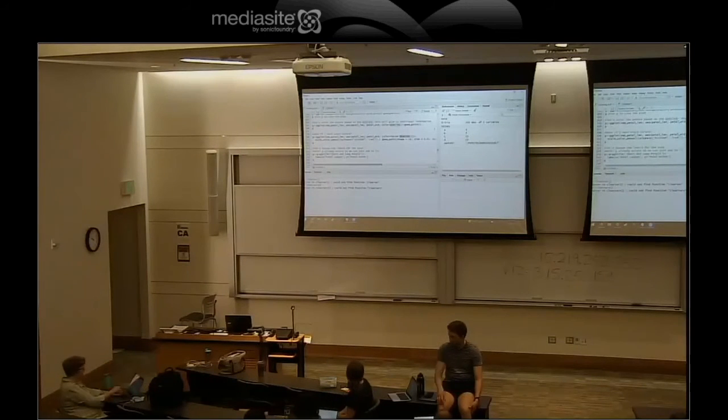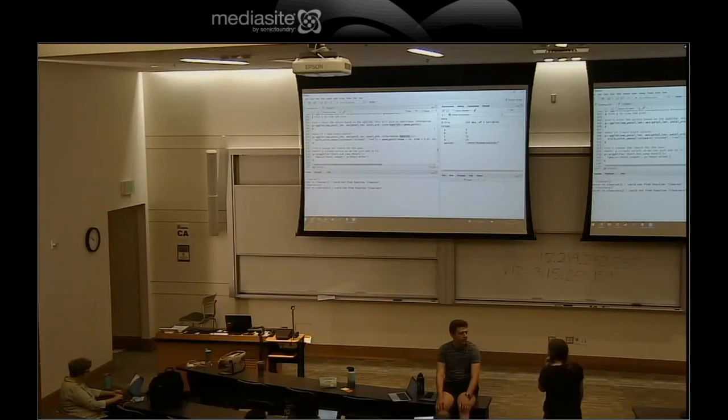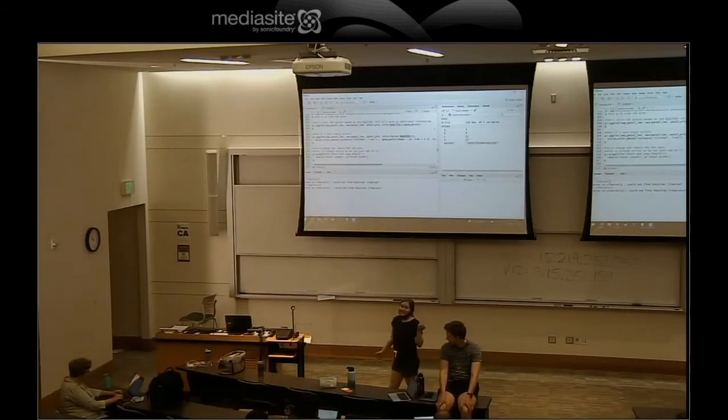Learning R, yep. It's in section 5 under what if I want exact colors. Okay, because I'm typing on line 309, it's not taking. Down a little further, when you make the big G combine, it's got the same thing, color factor, color. You can tell that I added a column called colors. That could also be it.